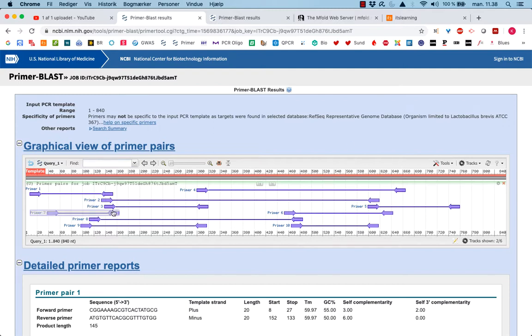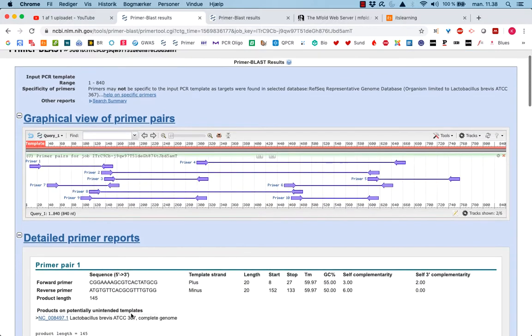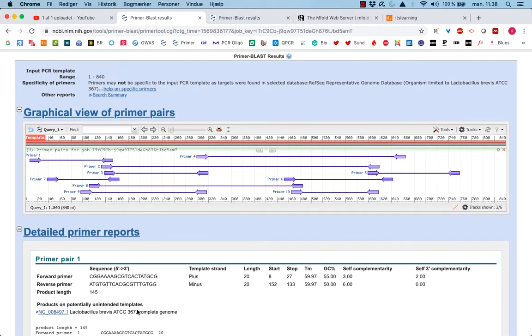First of all, I will check out the Primer Pair called number 1. It says it starts at position 8 in the sequence we uploaded and ends at 152. So that's the size of the product.